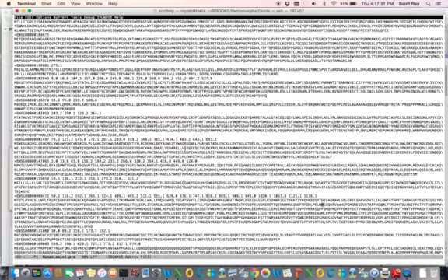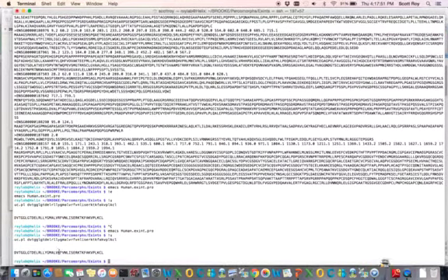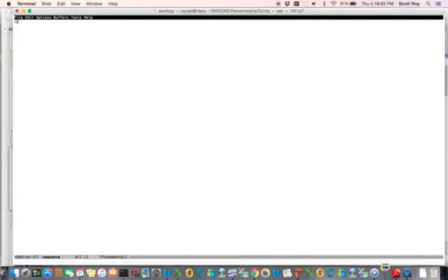Okay, so we're going to grab out some of this sequence, the flanking sequence, so that we can use it as a blast search against the fish genomes to see whether they have multiple homologs of this gene, some of which do and some of which do not contain the intron. All right, so the intron is right here in this R. If we look back at the file, we can see it's in this R. So we basically want to ask whether we see breaks in the genome at that position of that R.